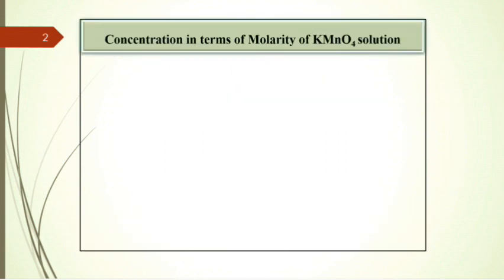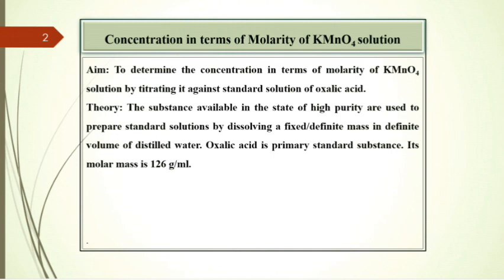Let us see the aim of the experiment. To determine the concentration in terms of molarity of KMnO4 solution by titrating it against standard solution of oxalic acid.